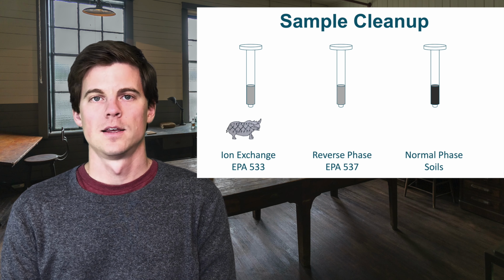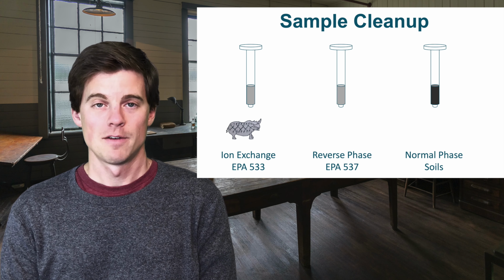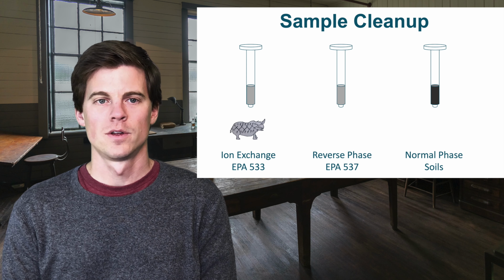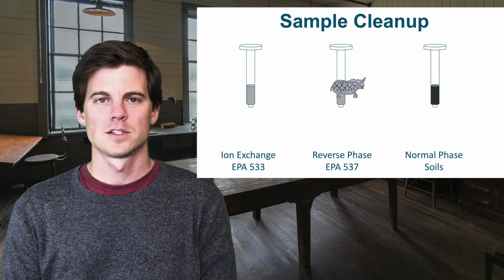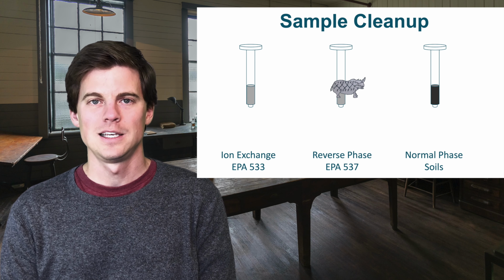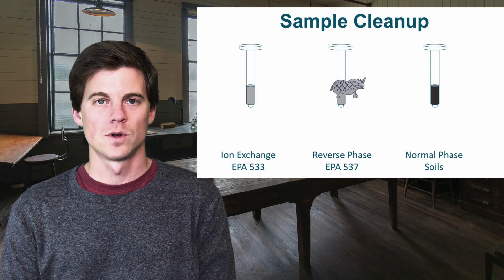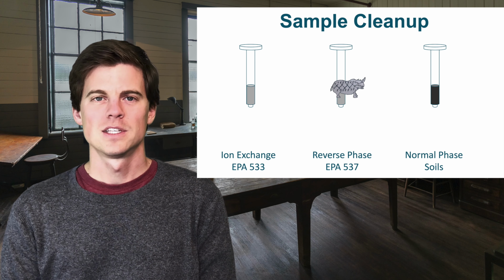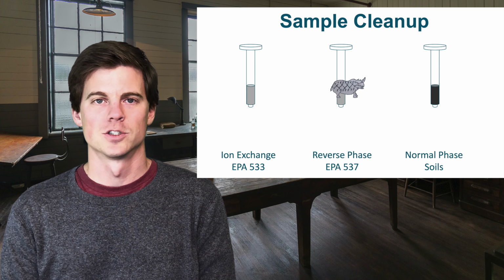The other way, which is the older way to do PFAS cleanup, is the way that Method 537 would have done. This is with just reverse phase. Similar to methanol, you use the fluorocarbon group on the PFAS molecule, which is sticky to certain things, so you would use C18 or divinylbenzene, something that's also nonpolar, like attracts like. We put the PFAS on there and they stick. This is good, but for some more polar PFAS, it's actually not good. It's not enough attraction to really hold them.